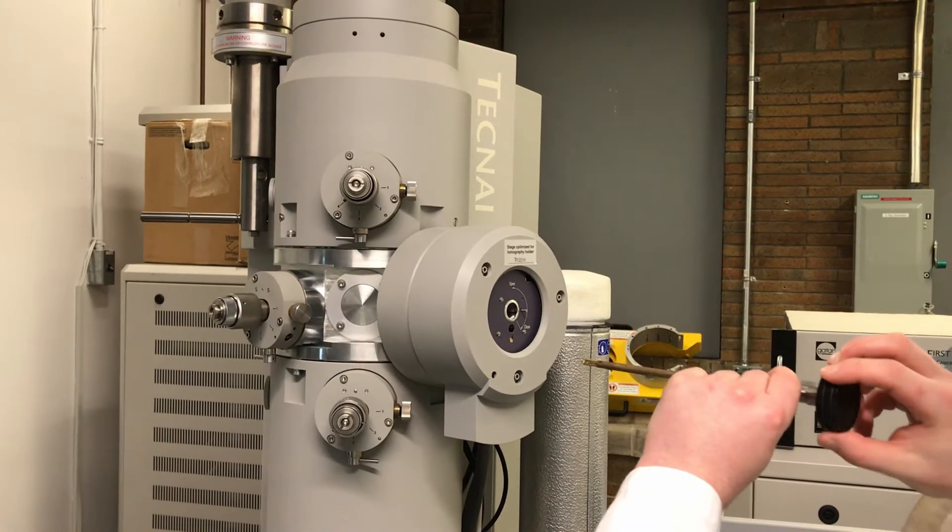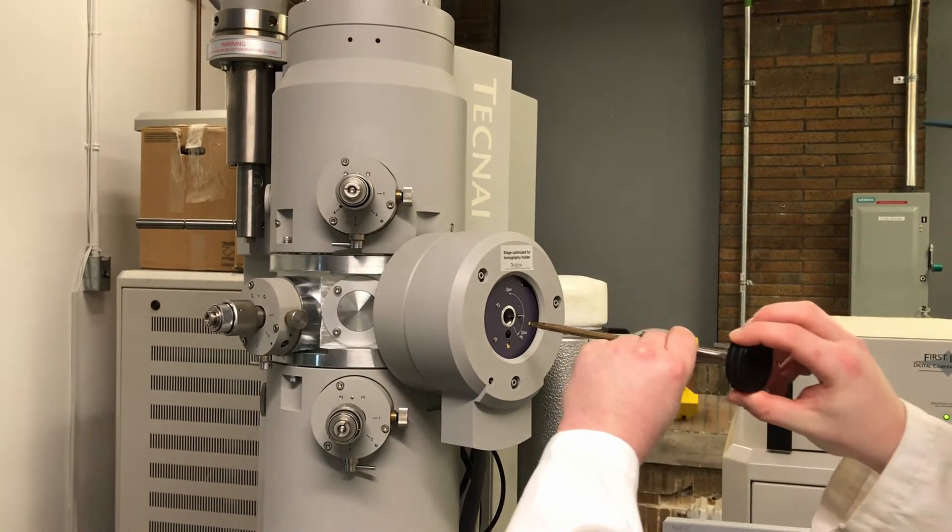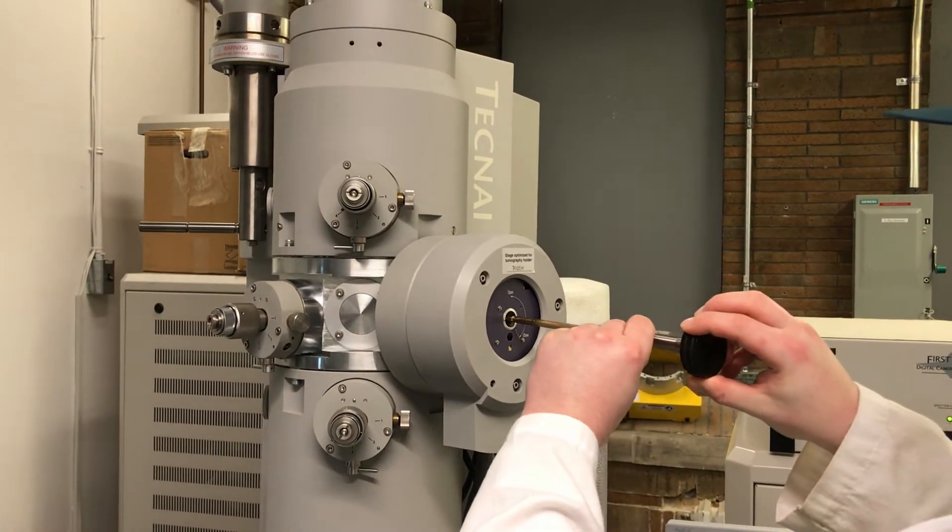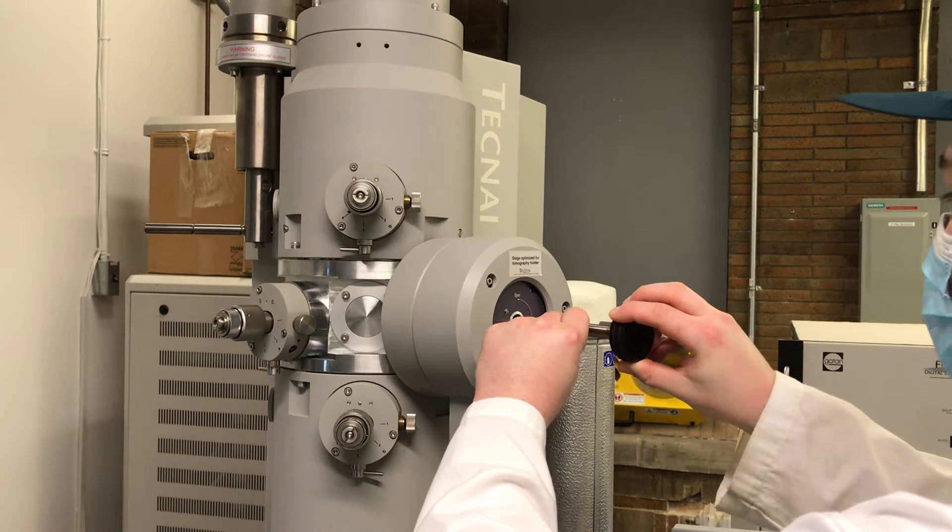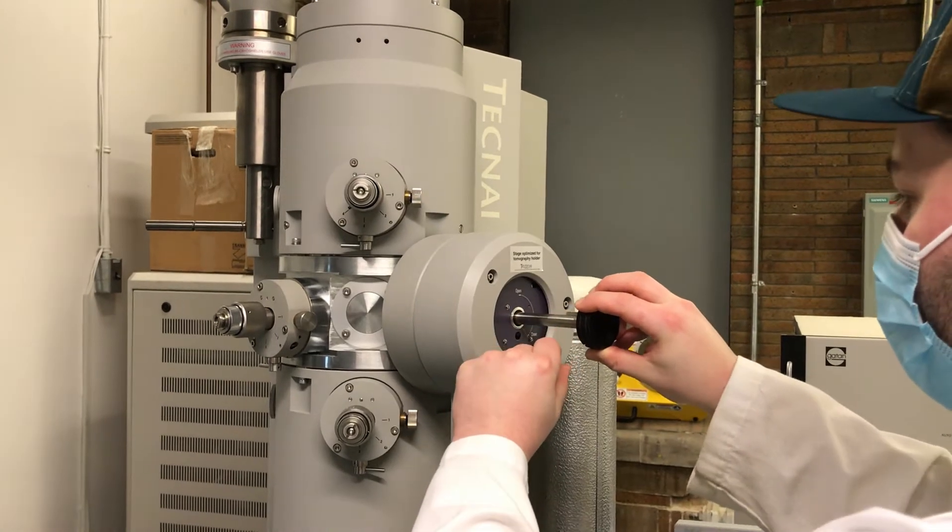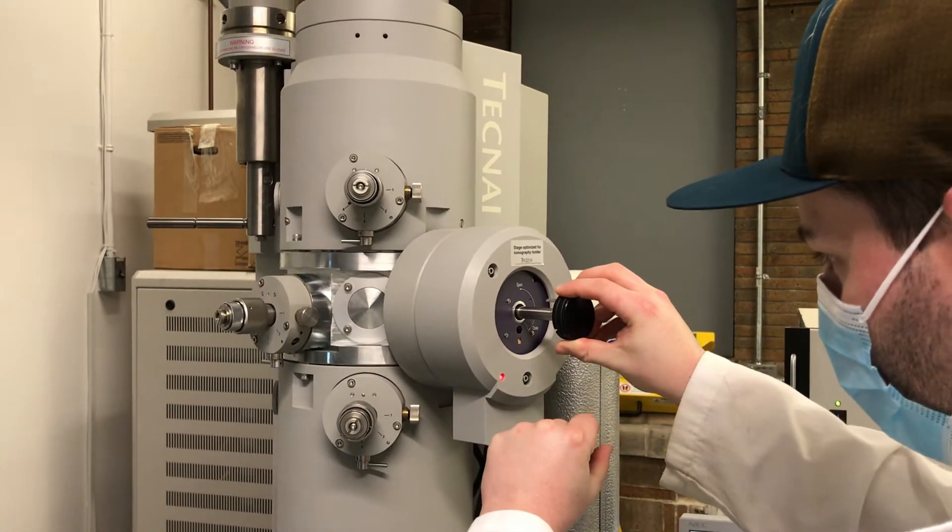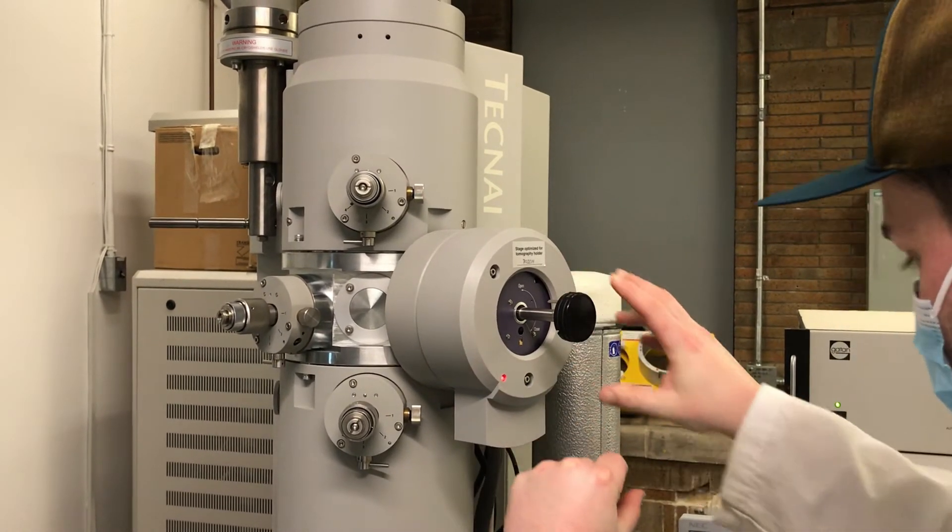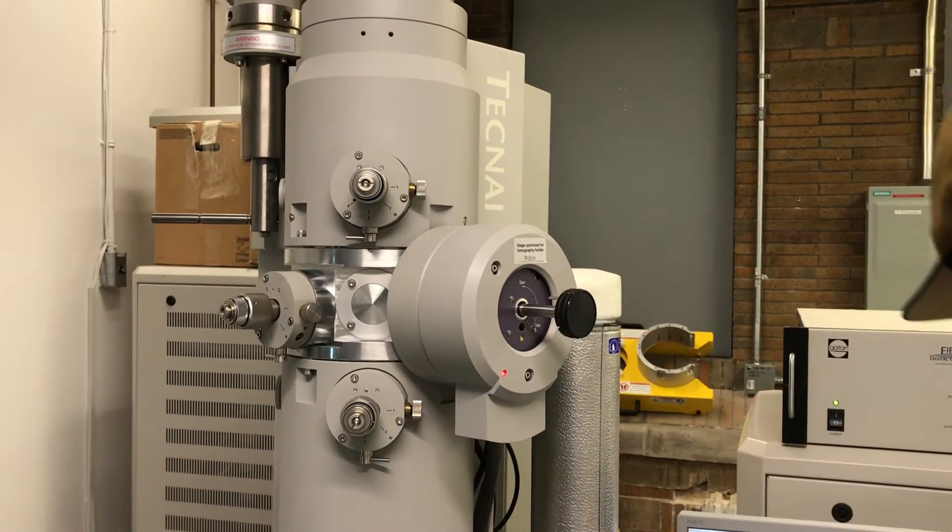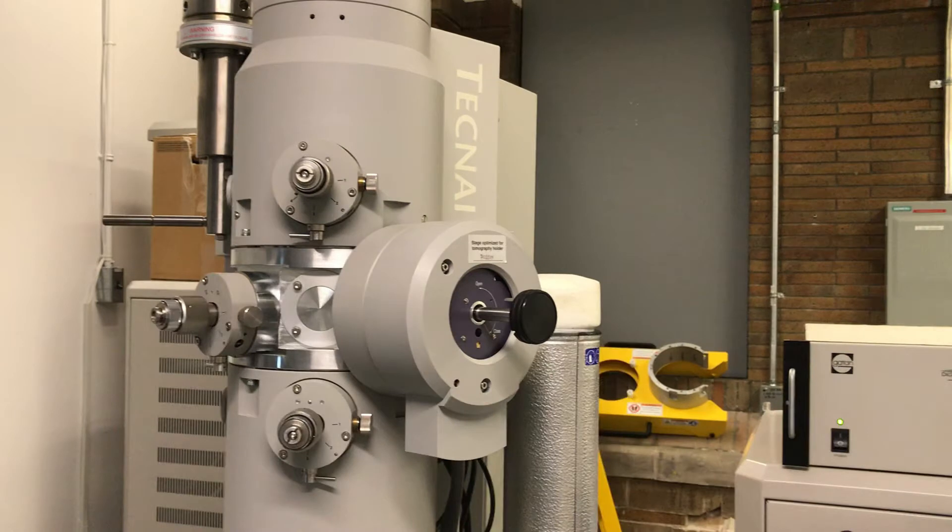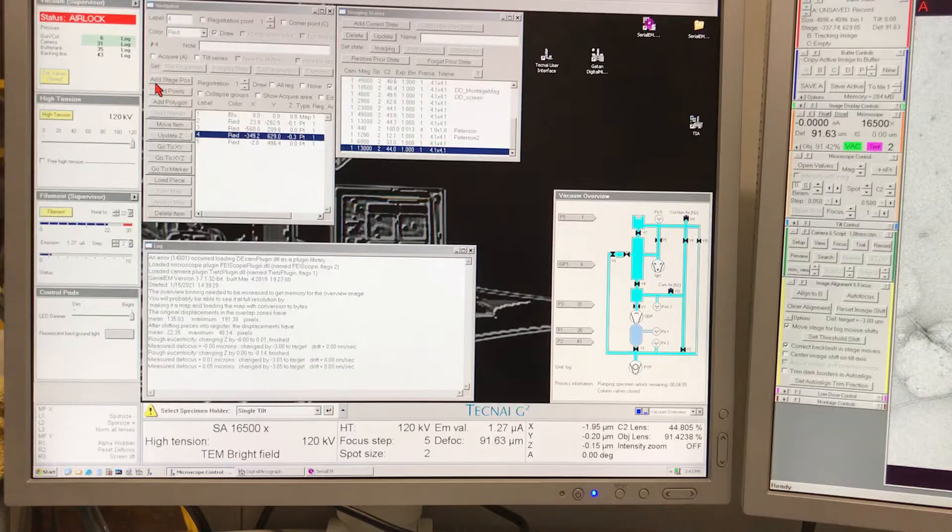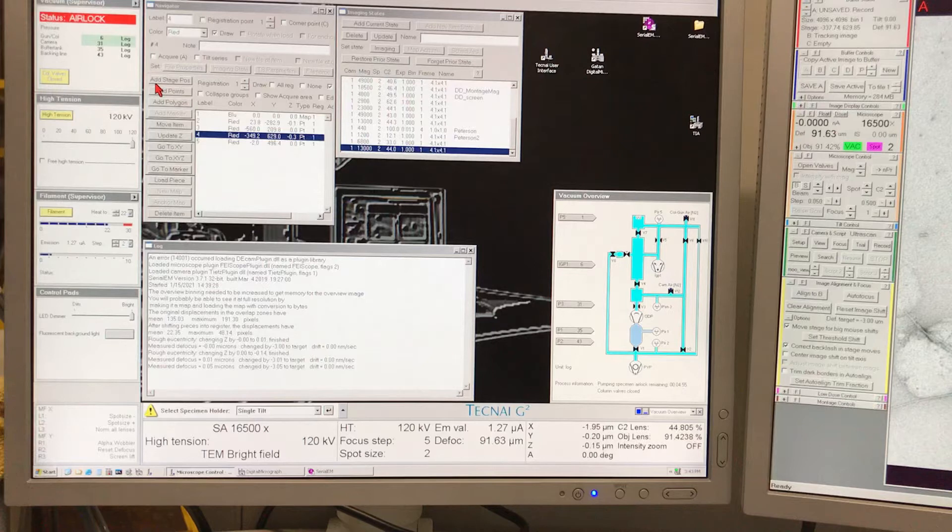At this point we are ready to load the grid into the microscope. We carefully find the right orientation of the room temperature holder pin so that it can slide into the goniometer without obstruction. As soon as you do it, the red light on the compute stage will go on and the user interface will ask you to select what type of specimen holder you are inserting into the microscope.